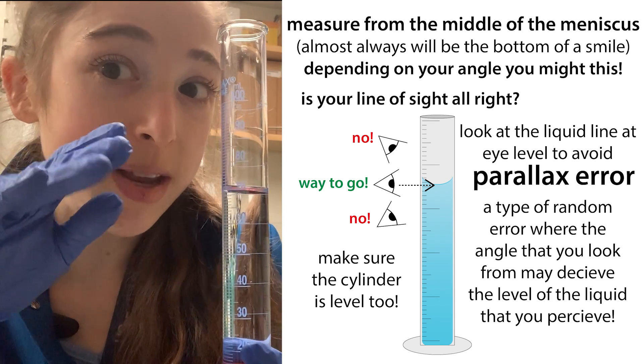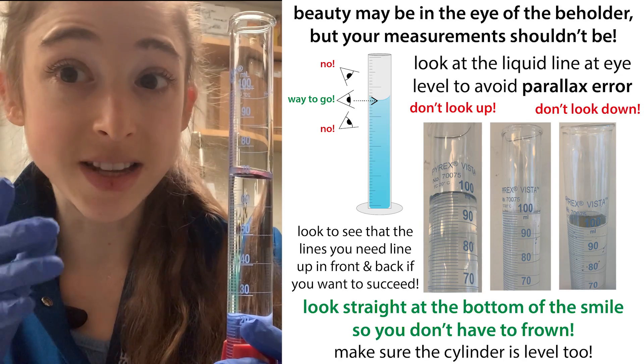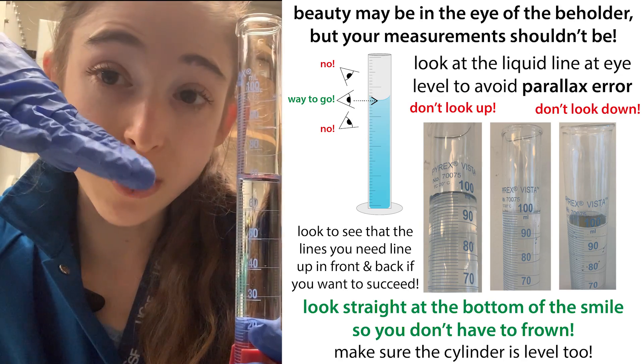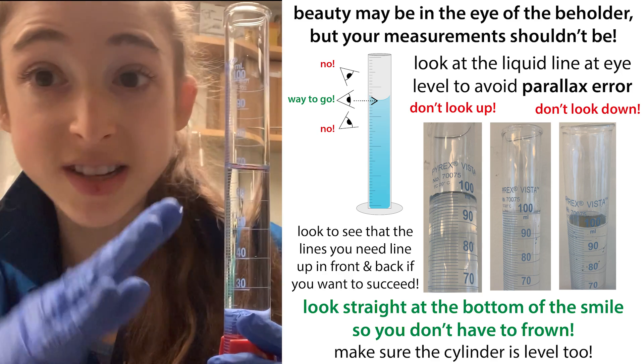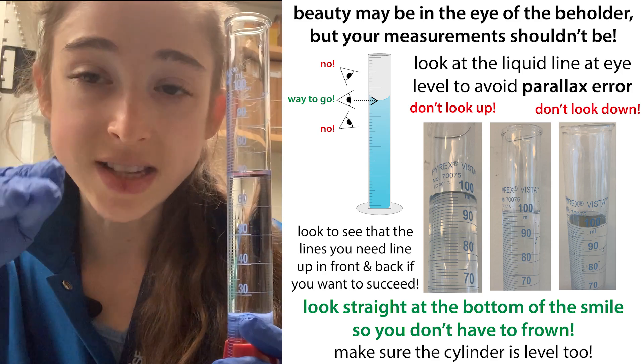And when you do this, you need to make sure that your eyes are level with the line. If they're not, then you have this thing called parallax error, where things are going to look like it's above the line or it's going to look like it's below the line, depending on your line of sight.